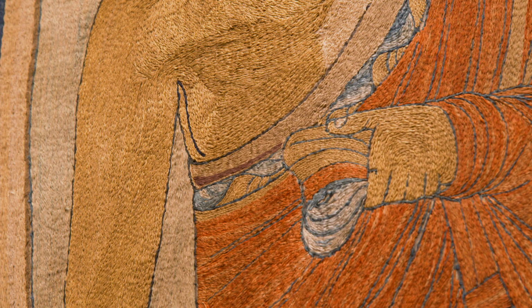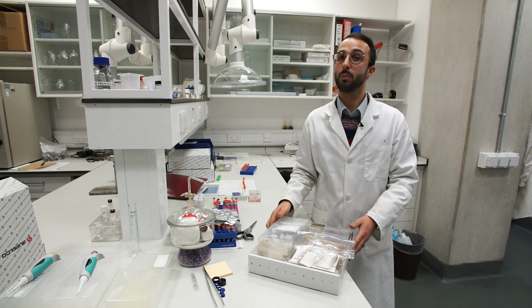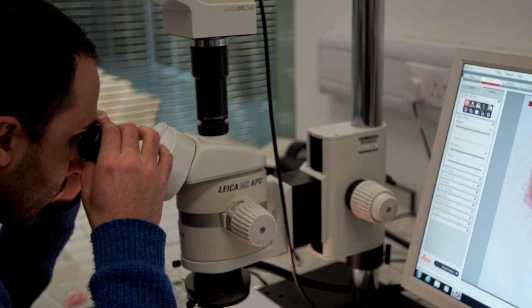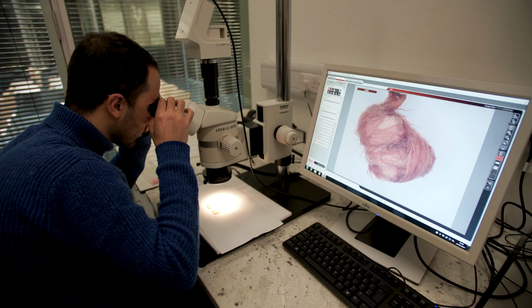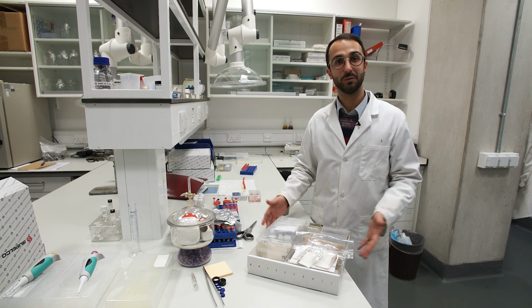And there is a little stripe of a purple dye. Purple dyes are very delicate and precious. We are talking about a very expensive colorant. It derives from some little shells, and each shell produces a little bit of purple. So if that purple is there, we are talking about what is called true purple, and in that case it might be a very nice discovery. So let's see.